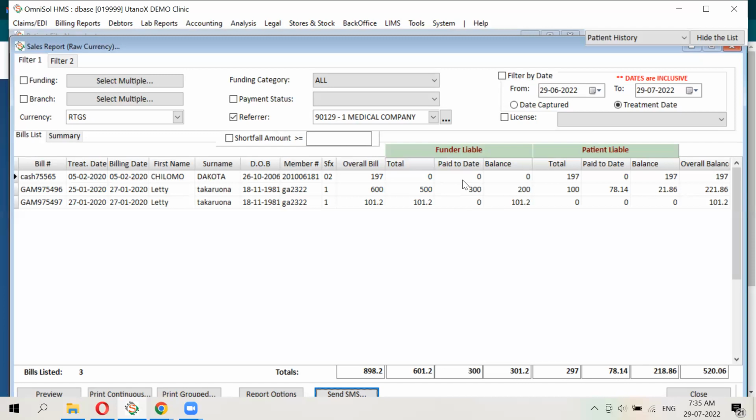Yes, that's what we normally encourage. And with power challenges, the power cuts, we find sometimes the client had insisted on their own server, but the server was hit with a power surge and they lost some data. So we don't really encourage having your own server unless you are willing to commit to significant resources to have a proper standard server room.